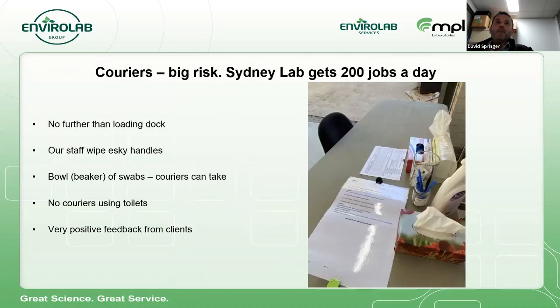Okay. So yes, couriers. Our Sydney lab gets about 200 jobs a day, the bulk of those coming from commercial couriers who are travelling all around Sydney. So we put rules in place. They were not allowed past the loading dock. All of the esky handles for samples had to be wiped down with alcohol wipes before our staff touched them with gloves.